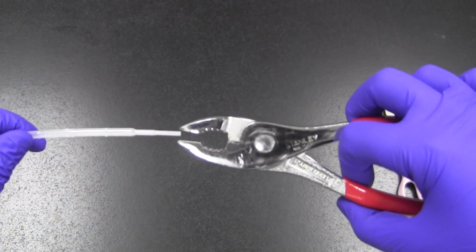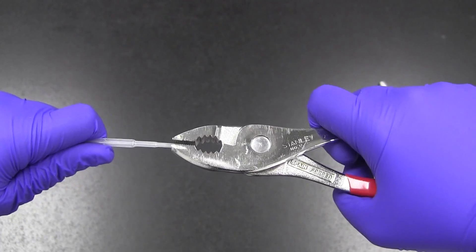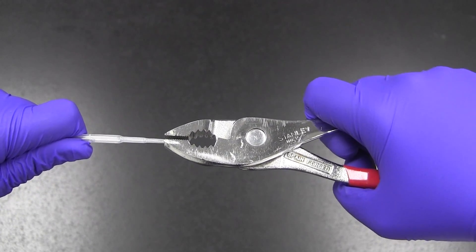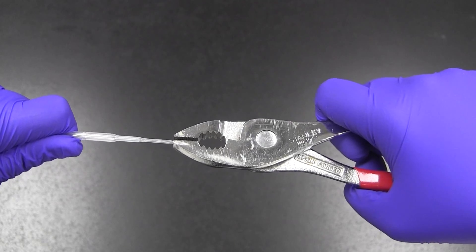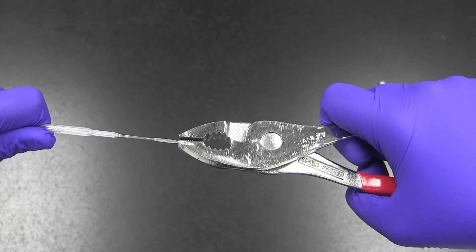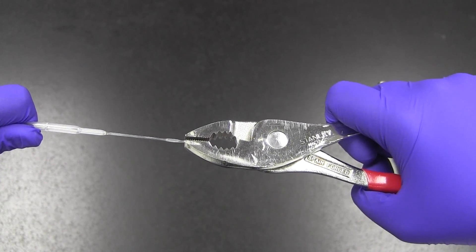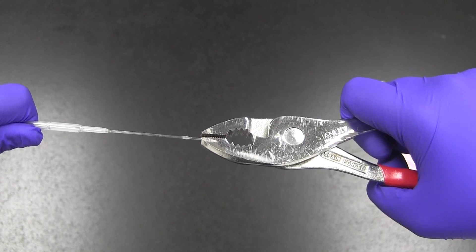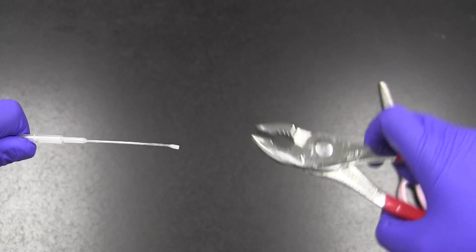To make the modified pipette, obtain a regular plastic pipette and pliers. Grip the tip of the pipette with the pliers and gently pull on the end of the pipette and not on the pliers. This will stretch the plastic. It may take some practice, but now you have a modified pipette.